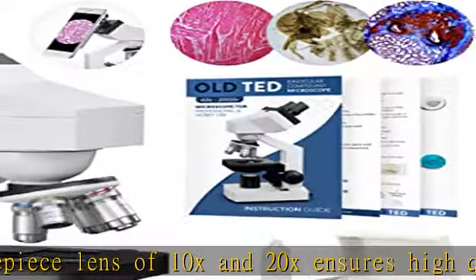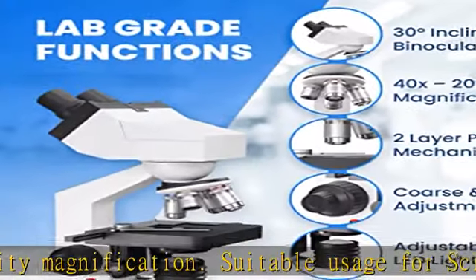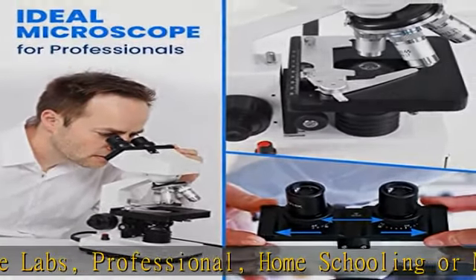The sturdy professional 2000x microscope for adults also comes with a cell phone picture holder to show off your slide experiments with work colleagues and family. Includes x10 specimen slides, x5 blank slides, and x20 cover slips.